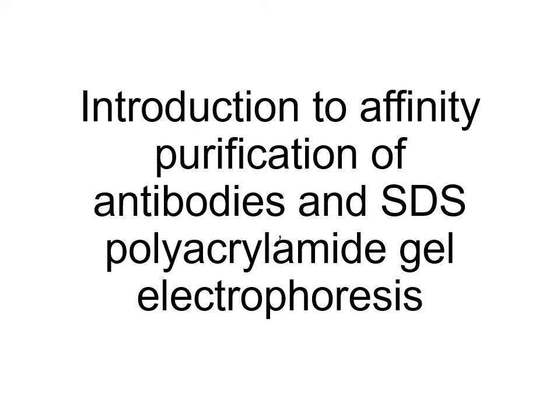Well, hello and welcome to our first online lab for Cell and Molecular for this fall semester. It's going to be about SDS gel electrophoresis and affinity purification of antibodies. And it's going to use results from last semester's student results for the experiment that they did. Unfortunately, you just get to analyze results and not do it yourself.